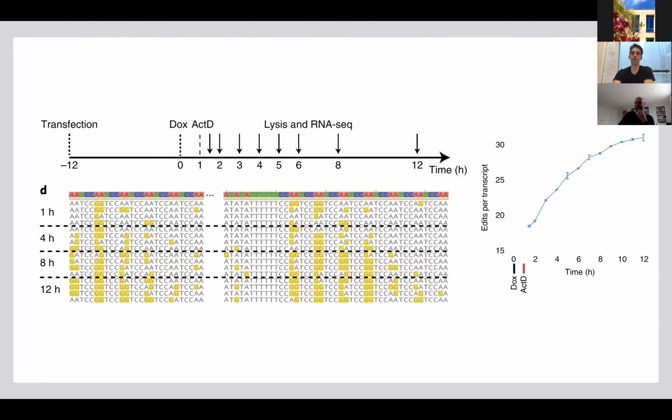The kind of experiment that you conduct is that you transfect a plasmid that encodes an RNA under a given promoter into some cells. This is all proof of concept stuff. I'll talk in a minute about how you would actually implement this. But you have a plasmid that is expressing this timestamp RNA. You put it in, you express some RNA, and for example, to generate an artificial transcriptional event, we'd use a doxycycline dependent responsive promoter.